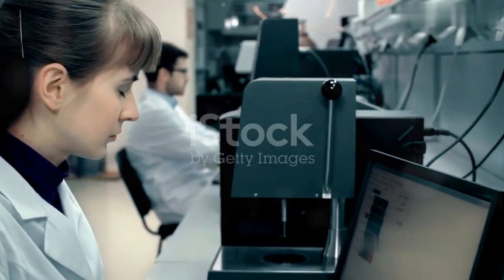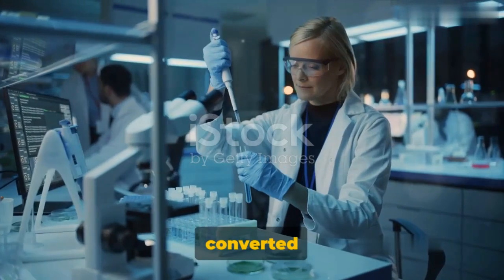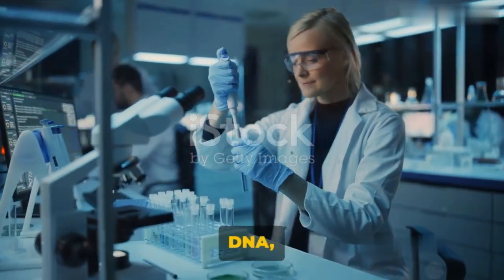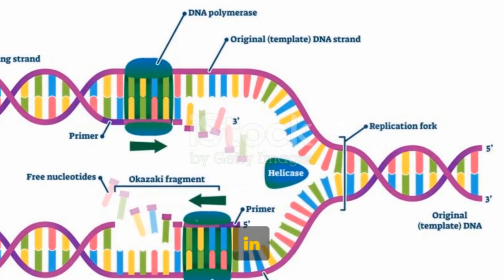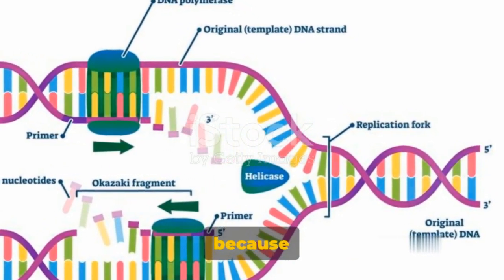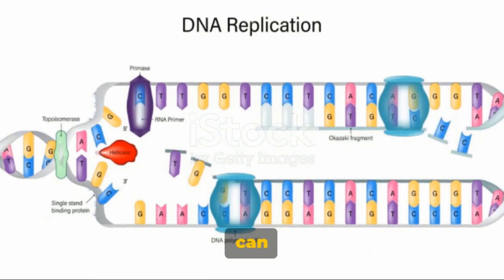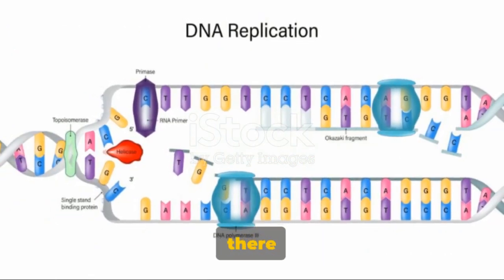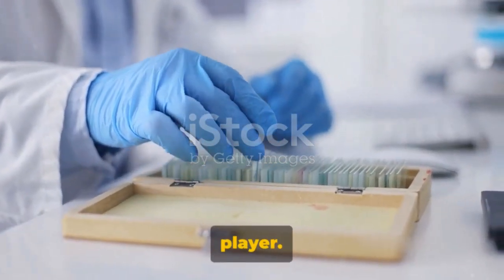But there's a twist. Before we can amplify this RNA, it must first be converted into something called complementary DNA or cDNA. This conversion is an essential step in the RT-PCR process because DNA polymerase, the enzyme responsible for amplification, can only read DNA. And there you have it. That's the role of RNA, our first key player.